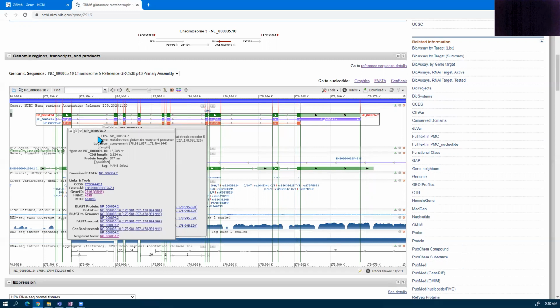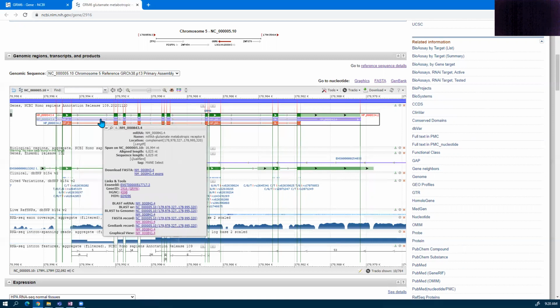So there's an easy way to check, based on the code, what those letters as part of that record actually mean. So if you get lost at some point with all of the data you're collecting, then go back to that code and that might help you.